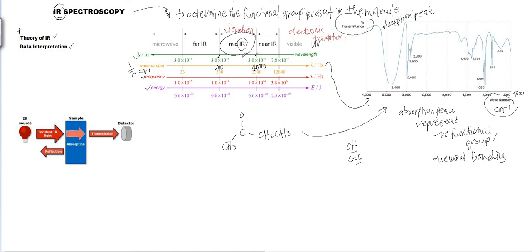So for the vibration, okay, for example, you have the molecule, and then you put the molecule in the sample holder in the instrumentation. Okay, so akan ada, so there will be several functional group, for example CO here, CH dan sebagainya. Okay, there will be a vibration once it absorbs the electromagnetic radiation from the infrared punya range.